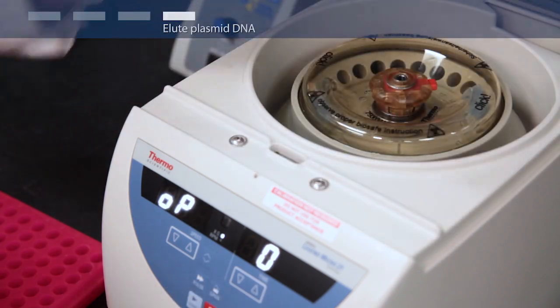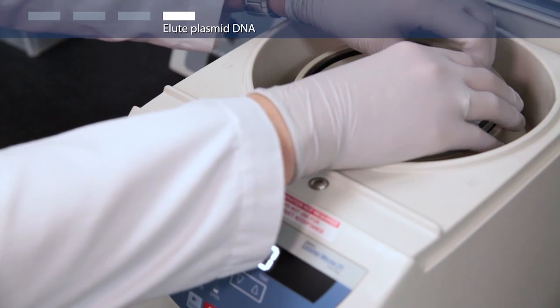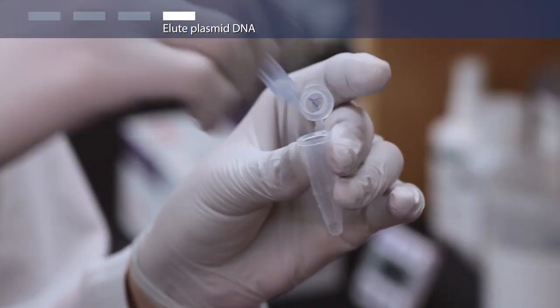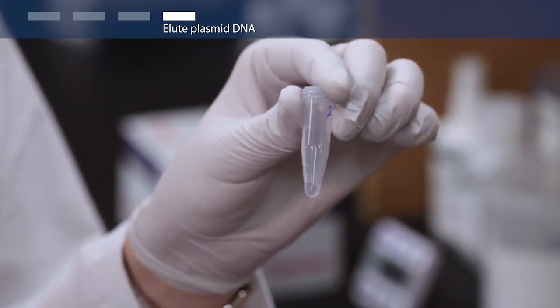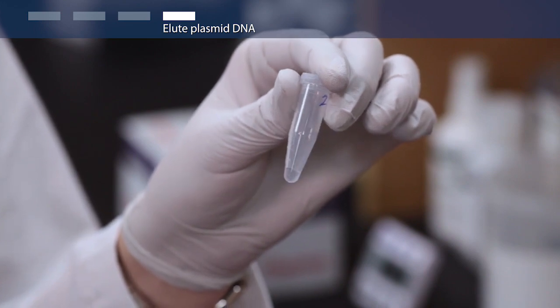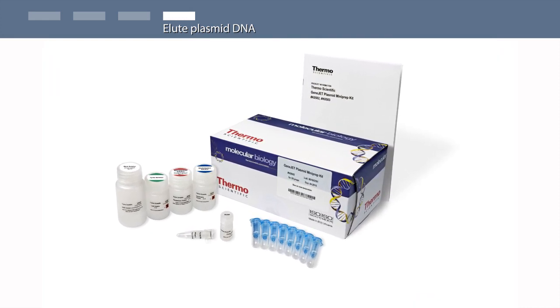To elute your isolated plasmid DNA, transfer the spin column into a clean microcentrifuge tube and add 50 microliters of elution buffer to the center of the spin column membrane. Leave for two minutes at room temperature, then centrifuge for two minutes and discard the column. Your molecular-grade plasmid DNA is in the microcentrifuge tube.